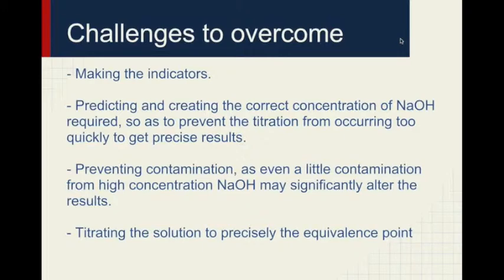And lastly, titrating the solution precisely to the equivalence point was a challenge because even with the right concentration, one can easily overshoot the equivalence point. And so to get the most precise measurements, we had to titrate slowly and carefully.